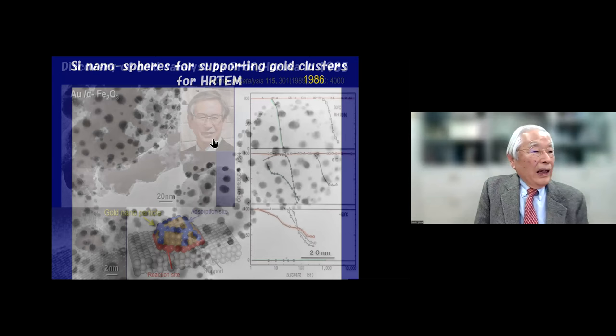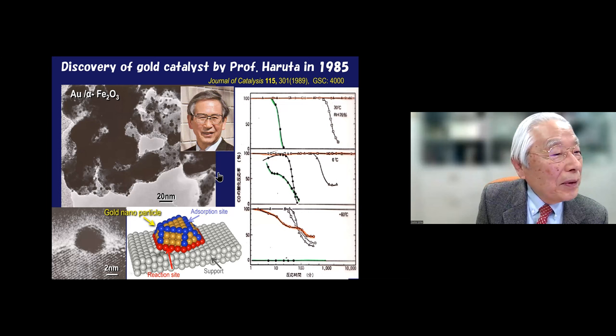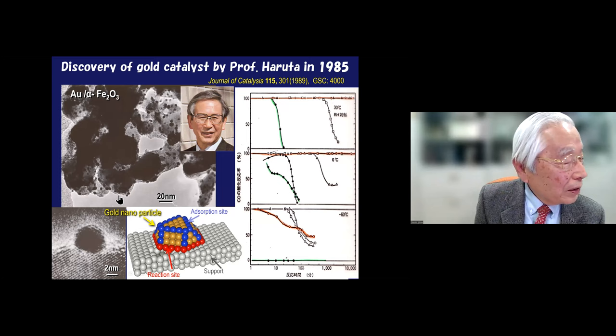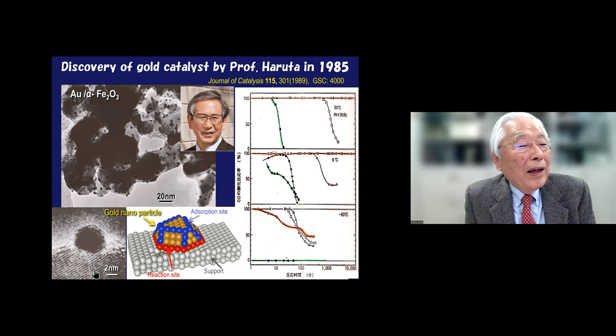Anyway, not only just seeing the gold particle, but soon after, Professor Haruta came to me and he wanted to see his gold catalyst. So this is my micrograph. By the way, when Haruta discovered the gold catalyst, the world famous catalyst professors did not believe his discovery, and so he had a rather hard time at the beginning.